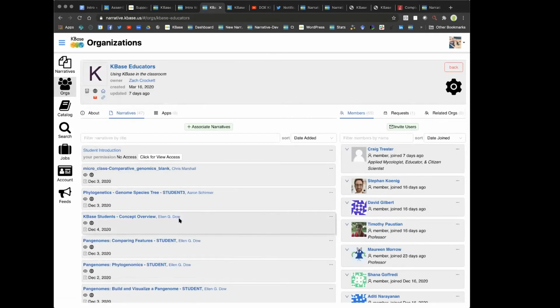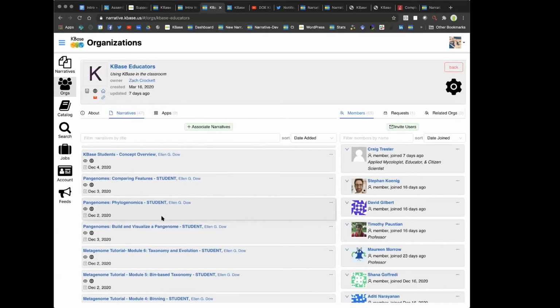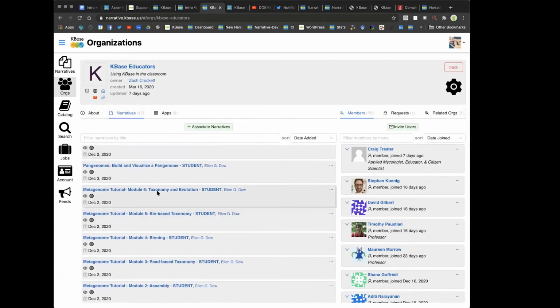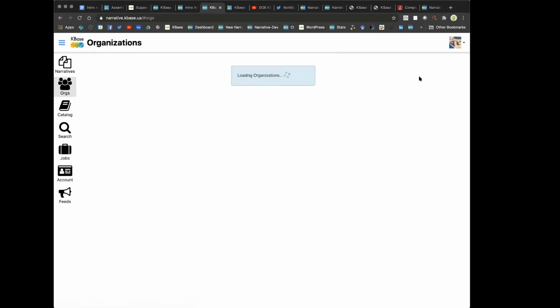You'll see a lot of different narratives in here that show different exercises and different kinds of material for teaching students not just how to use KBase, but how to do some of these fundamental processes for bioinformatics. So a lot of different stuff in the educators org. Very, very valuable resource. So go and check that one out.